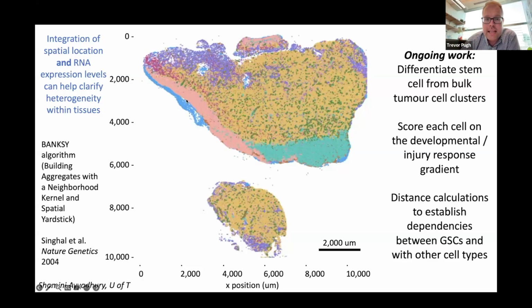So this is really the state of this analysis. The immune cells, really a nice, relatively homogeneous population. You can kind of pick out by eye the blood population. So there's blood vessels that are going through some of these tumors. So you can actually pick out these immune cells that are occupying the blood vessel component. You can see some of the immune infiltration. But really, it showed to us the importance of having some of that spatial information to guide clustering of the RNA sequencing data. And really, this is still ongoing work.